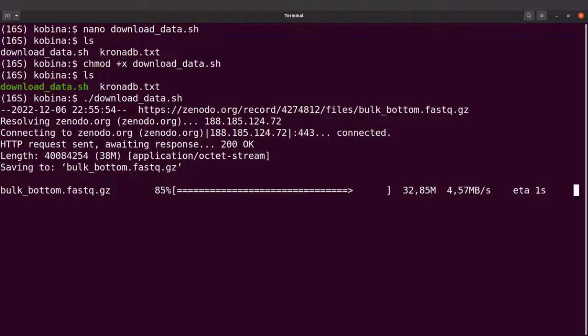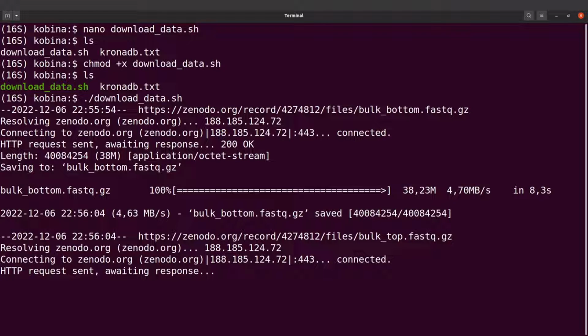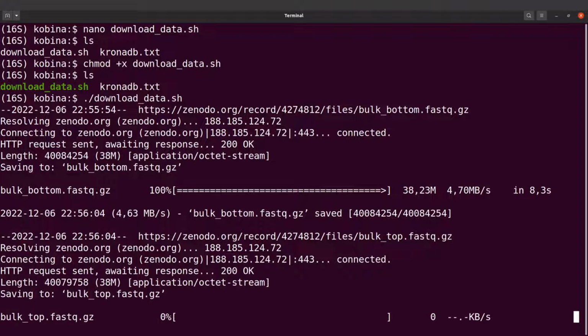So here, you don't need to write a script for it. The most important thing here is to download the files. So whether you use a browser or you write a script, just make sure you get the files. That is what is important here.